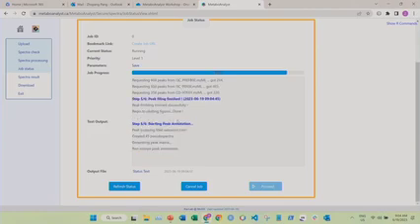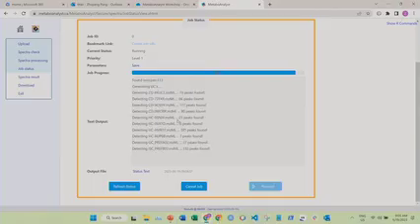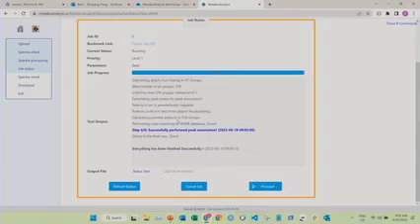So we actually use the QC to do the parameter optimization. If you don't have QC, we're going to guess which sample probably gives the largest size. We use that one, which has the most signals, for optimization. If you upload a lot of spectra, we don't use all of them to do optimization. We just pick the typical ones, like 5 or 3, to do optimization. So this is that purpose. If you provide the information, later you can use the functional analysis because you need to compare the groups.